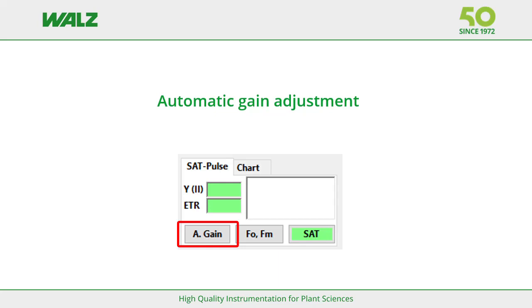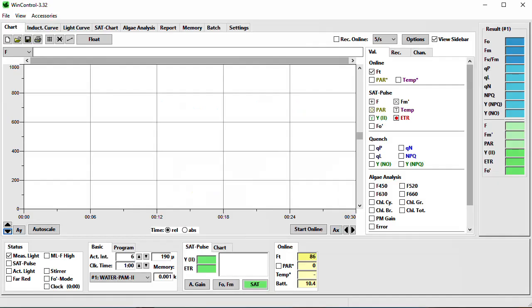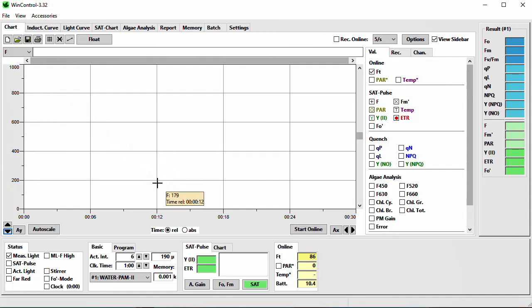One of the most important buttons to achieve good measurements is the button for automatic gain adjustment. WaterPump 2 instruments have a very wide adjustable sensitivity range — you can measure visibly colored lab cultures and also samples with very low algae content like seawater with chlorophyll A concentrations of less than 0.1 microgram per liter. Please use the automatic gain button to bring the instrument into the optimal photomultiplier detection range, so that following saturation pulse experiments will be within the detection range.